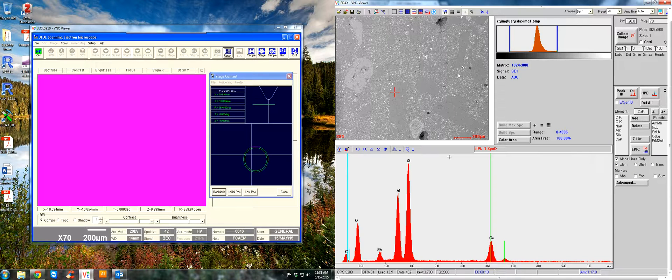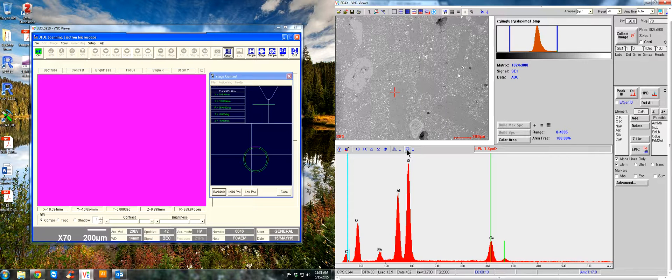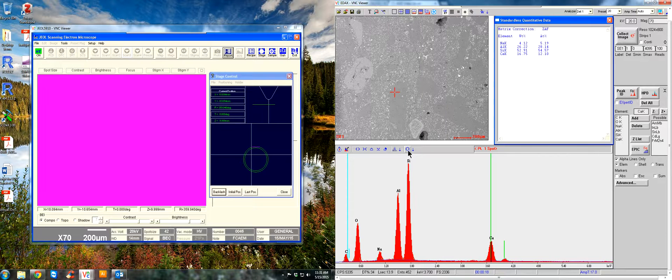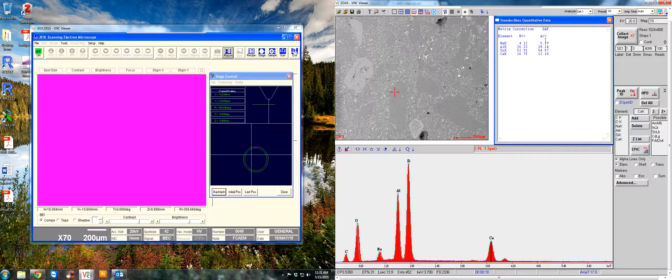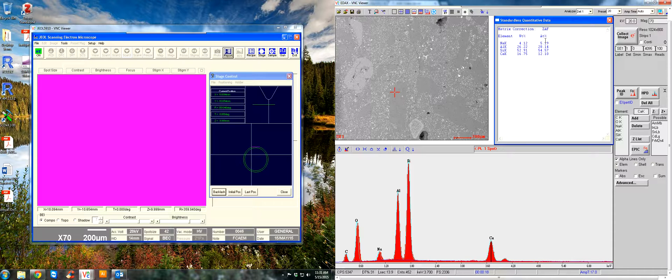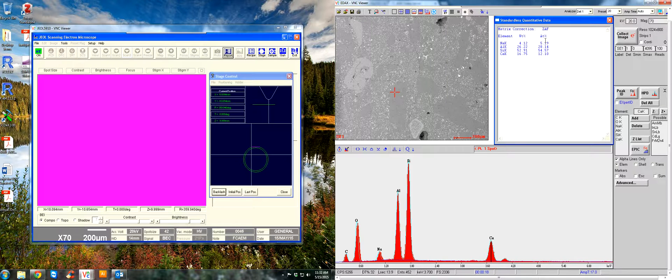Now, if you want to quantify the elements in the sample, you would hit this Q button right here. So this window pops up and it will give you the element weight percent and the atomic percent. And the atomic percent is useful because you can use it to predict formula units. So when an element is part of a compound as it is here as part of a phase, you can kind of use it to predict the formula of that phase.